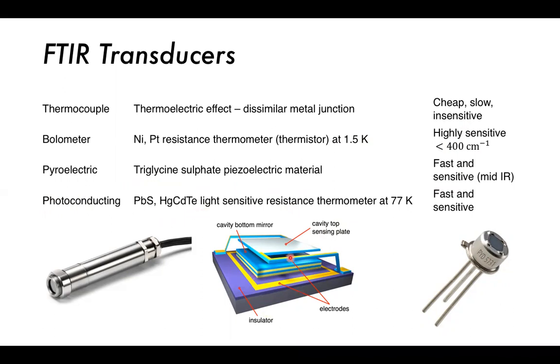These are kind of like the CID arrays that we have. Usually this is in most modern high throughput FTIR instruments. We have these CIDs, these arrays of photoconductors. The reason why we do this is so that we can take the whole spectrum in one go. And so we're not just limited to the same as our UV-vis, where we measure wavelength by wavelength.